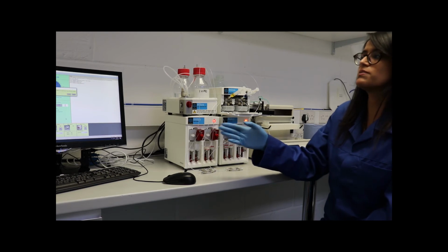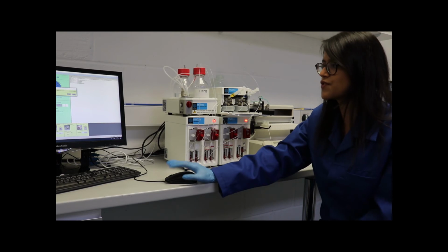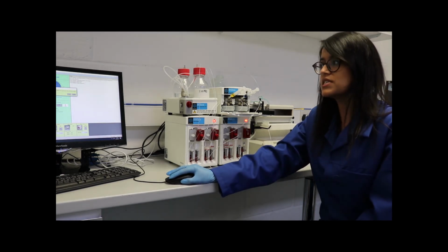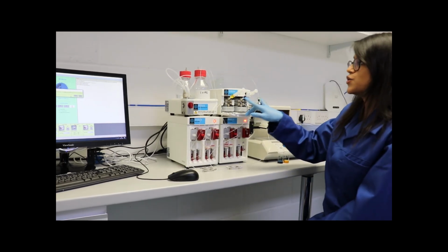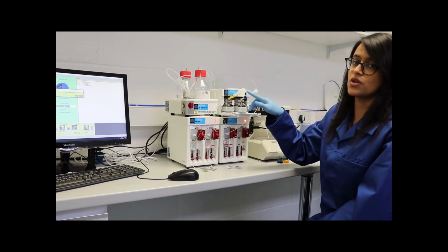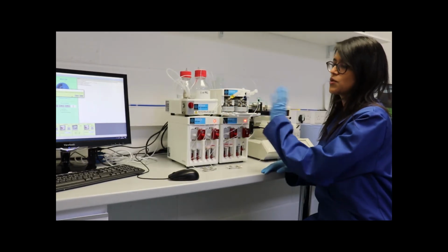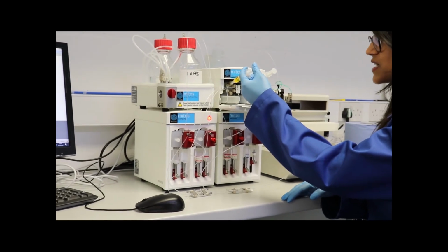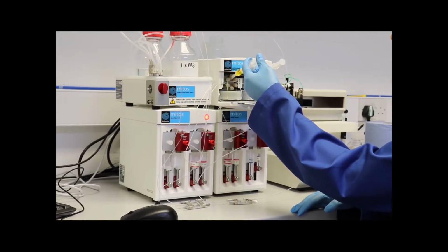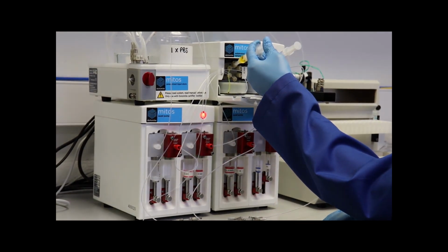Now the system is prompting me to load my nanoparticle precursors, in this case the food dyes. It's telling me, please inject 2 ml into sample loop 1 and 2 ml into sample loop 2. This is because we're loading the total volume of all 4 experiments together, and because it's a 1-to-1 ratio, 2 ml in the first one and 2 ml in the second one. So I'm going to go ahead and do that. The first one is nice and yellow. Hopefully the camera will be able to display some dye going through the tubing.